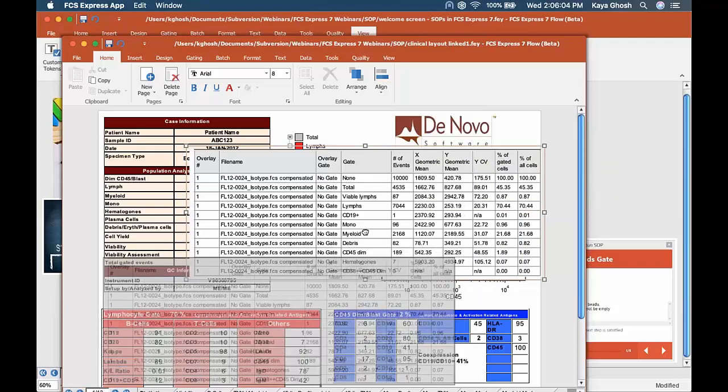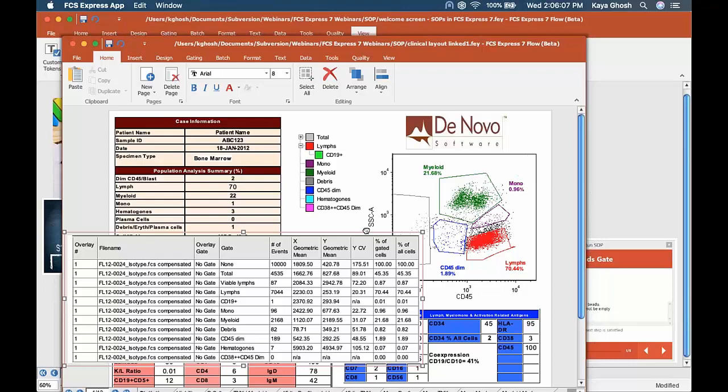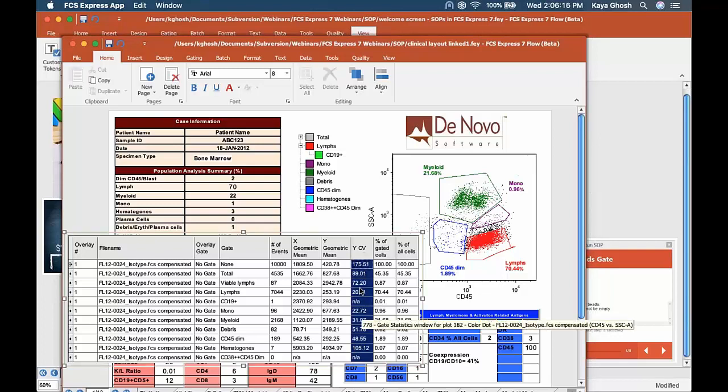As long as you find a specific plot whose CV you want to base the requirement on, it's probably a histogram, I'm guessing, just choose the appropriate X or Y. It's probably X if we're talking about a histogram. And yeah, you can just build in the tokens the same way.